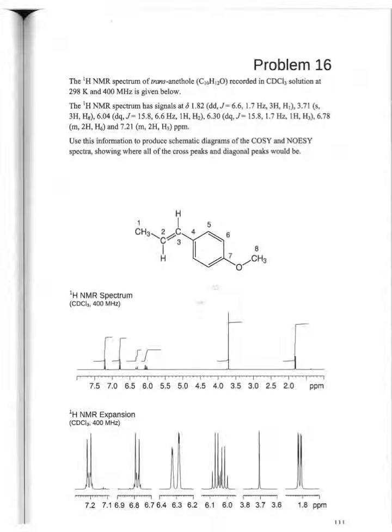Notice that I did not put in any numbers in terms of millimeter heights of these integral peaks. So this line that's called the integral, that S thing. And again, the software integrates the area under that curve. Pretty much any modern analytical instrumentation does AUC, which is area under curve. It's just math, it figures it out. Spits out a number.